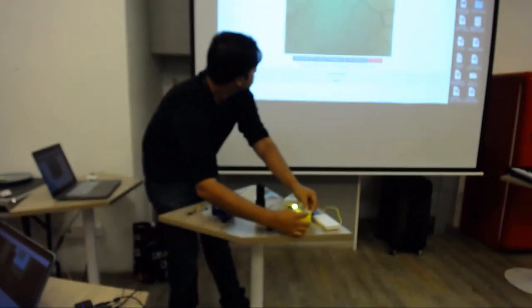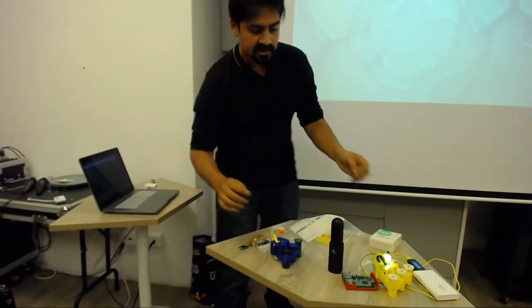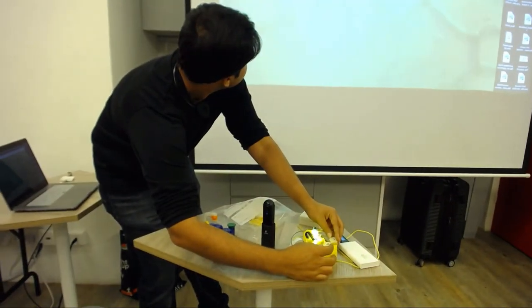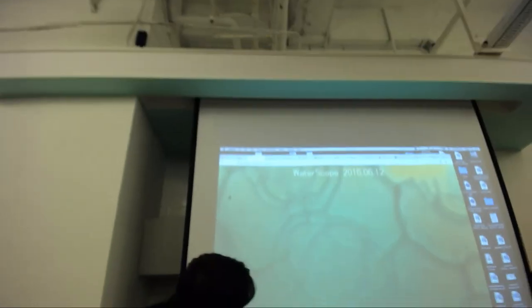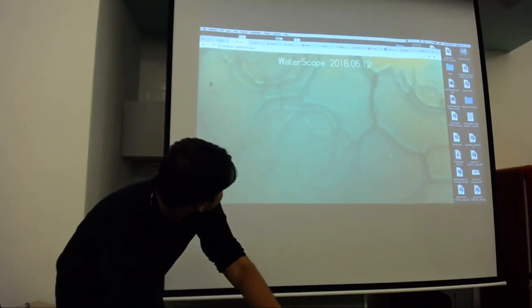There you go. Oh, nice. Also, you can just tap on the thing in the middle and it'll make it full screen, which is great. And now we can focus all the way. Oops, going the wrong way now. Okay, well, this is, I think, the biggest I've seen this particular thing.